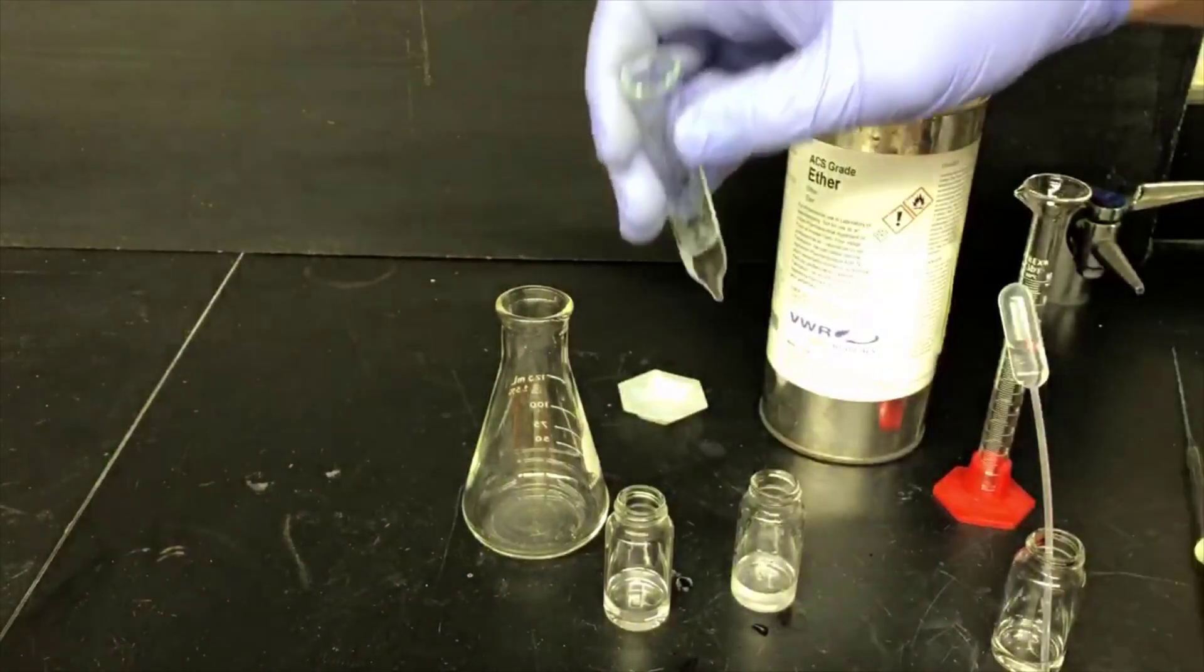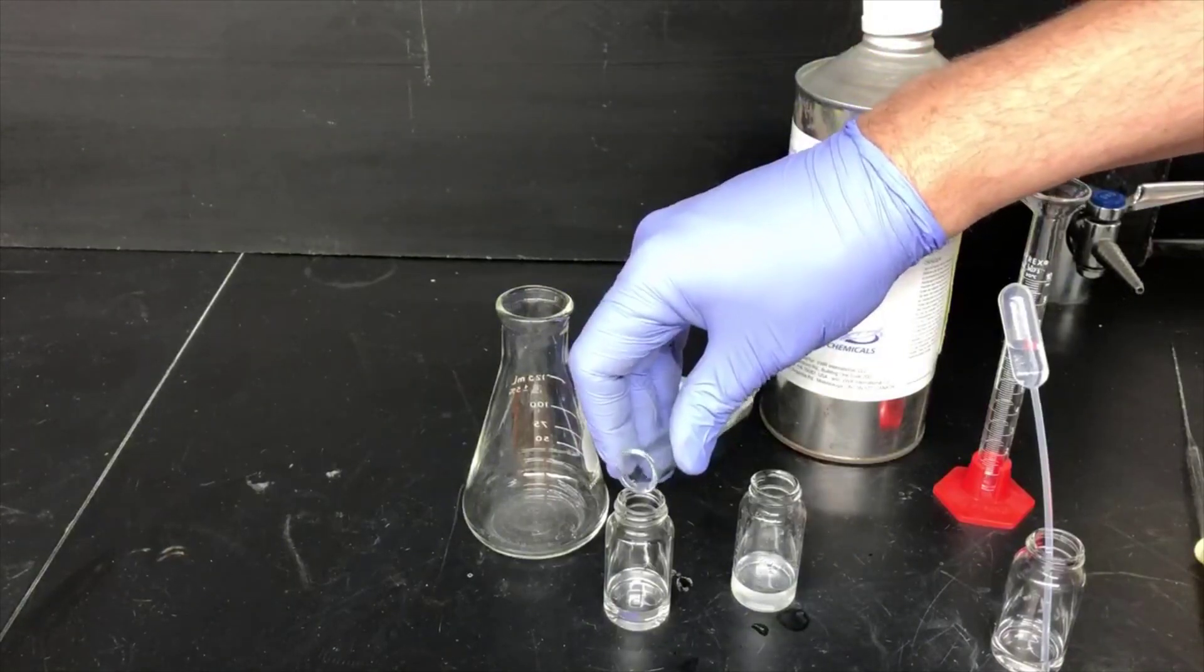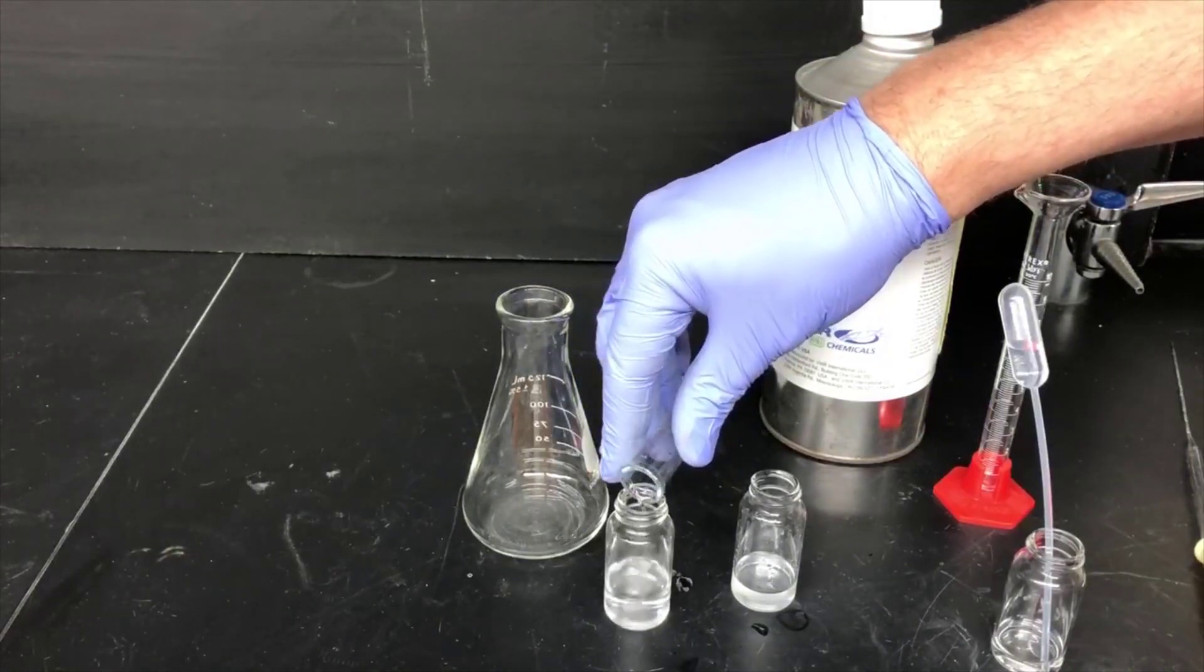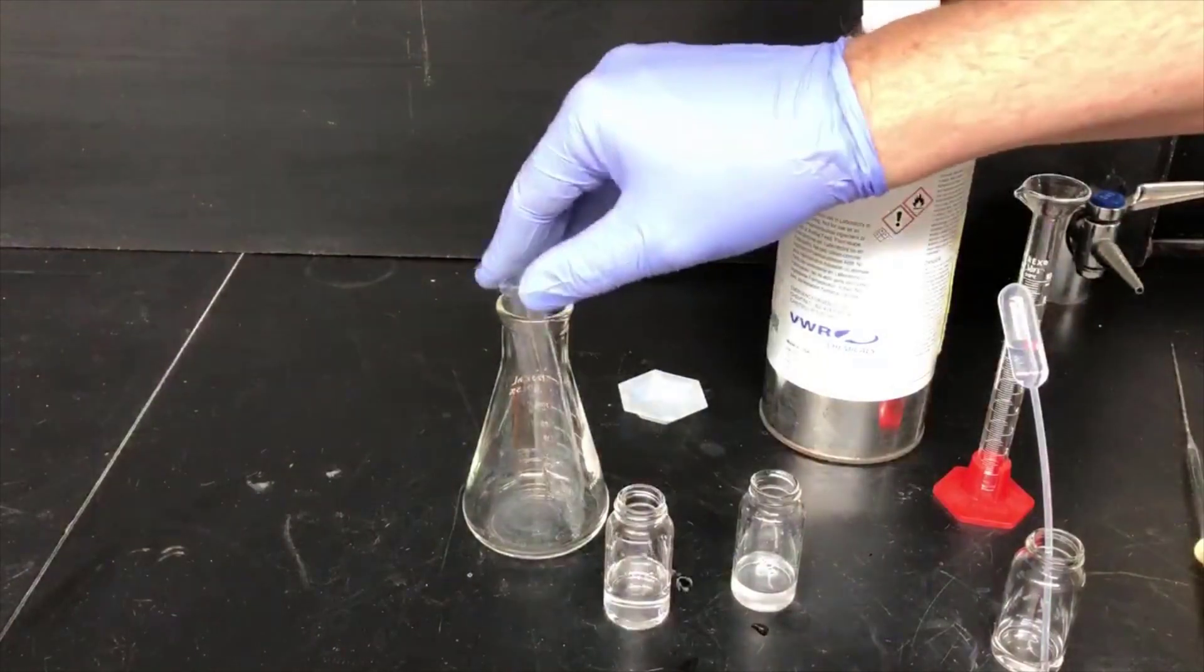And pour the top layer out the top into the vessel that contains the other ether layer. We're combining ether layers here. This is where the cyclohexanone product is.